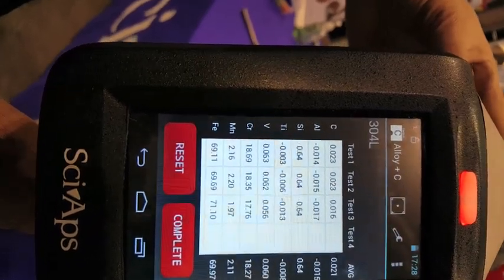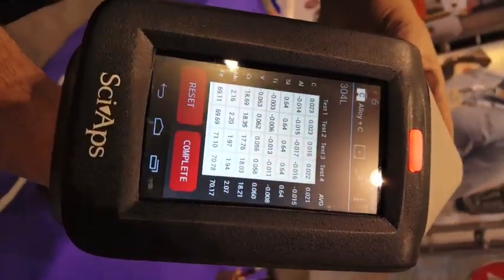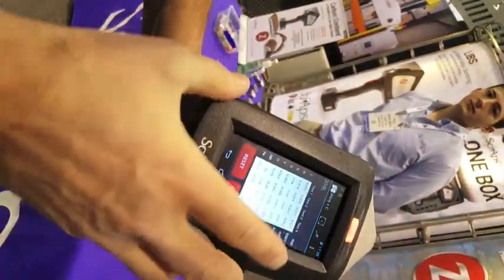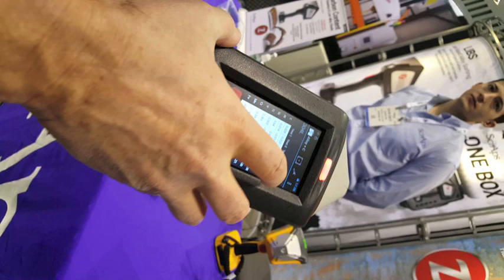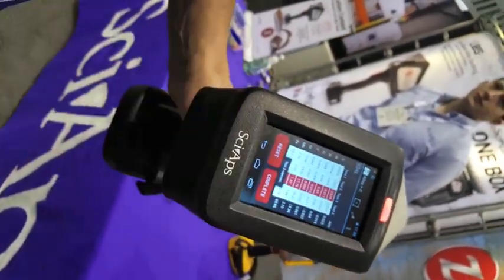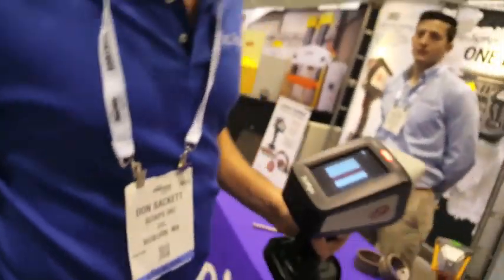016 — there's one of those crazy burns. 022, so there we go. Most customers and users could keep the whole thing because the cert is actually 024. We came in at 021, but if you tap that one and take it out of the average, you're at 023 — within 10 ppm of the certified value.